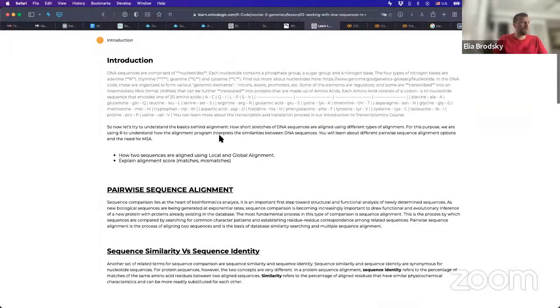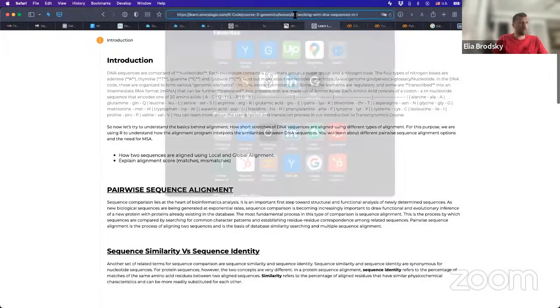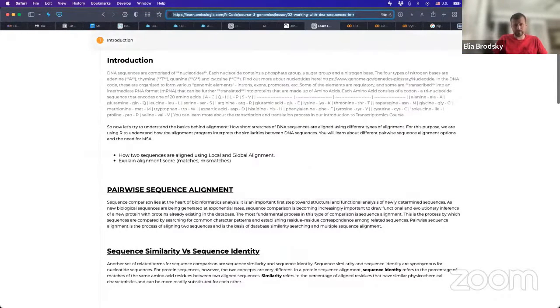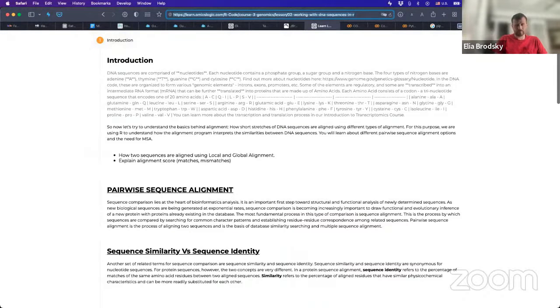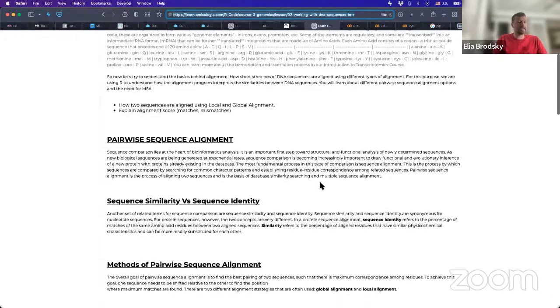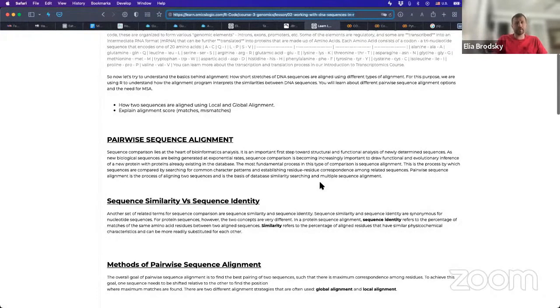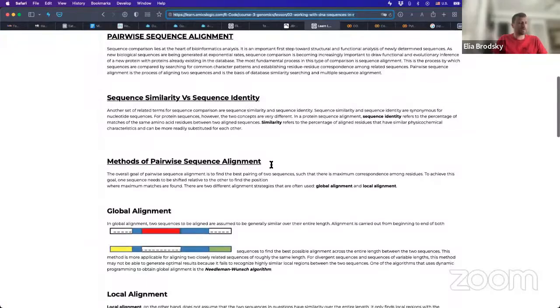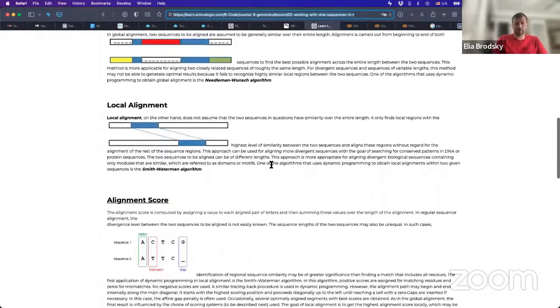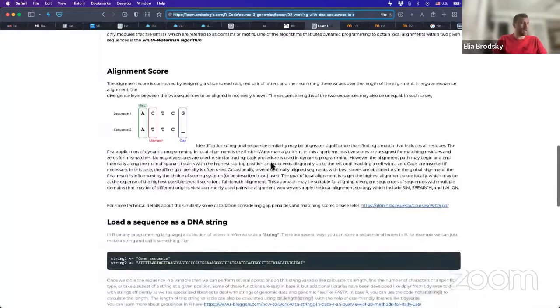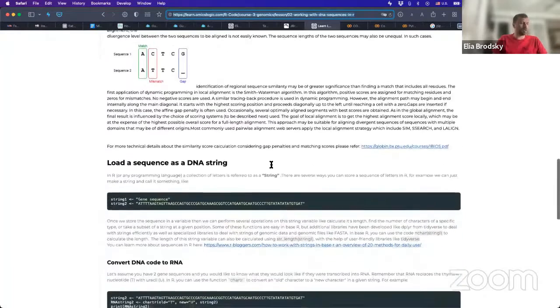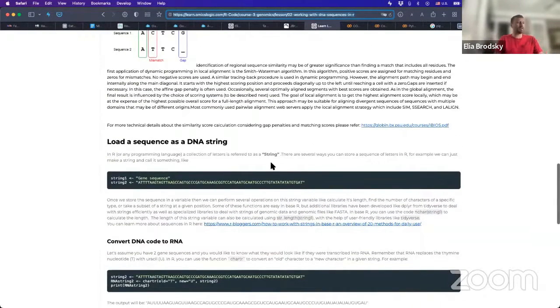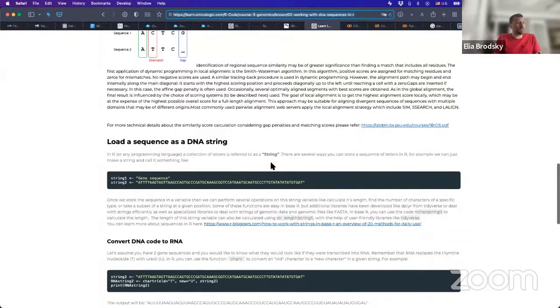And the first thing that we'll do is we'll go to this lesson working with DNA sequences in R. Okay, so if you are following along, this is the link. And here it gives a very detailed explanation of pairwise sequence alignment, multiple sequence alignment, etc. And so this is something that you can go through on your own. But you should be able to start understanding as a result of this lesson, how can we deal with these strings of letters?